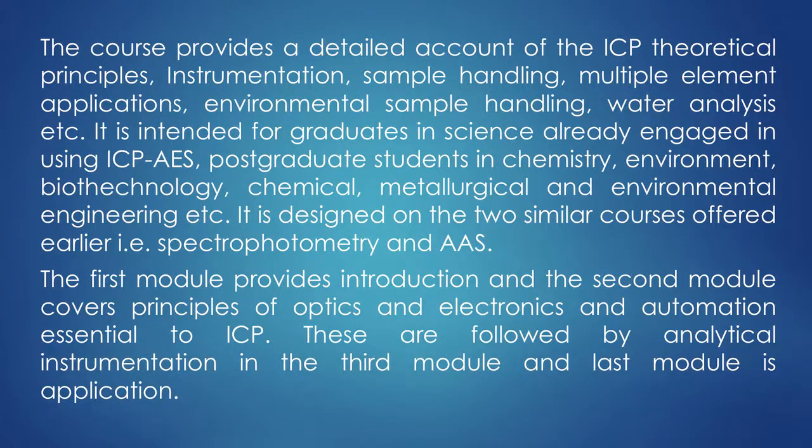Otherwise, what I will be teaching you in the third module, apart from instrumentation, is the analytical aspects of chemical element analysis, followed by the applications. We will be covering most of these principles of the ICP-AES technique, and I wish you good learning.